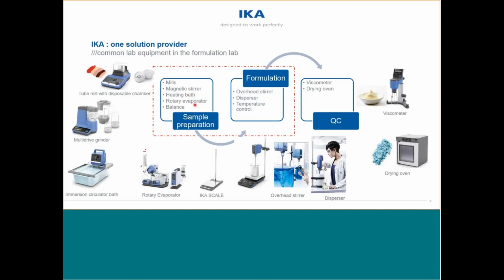Other than that, if you are required to extract a desired component from the raw material before you can use it in the formulations, a rotary evaporator is also required in some formulation labs. Okay. And the most common equipment used in sample preparation is the balance, right?